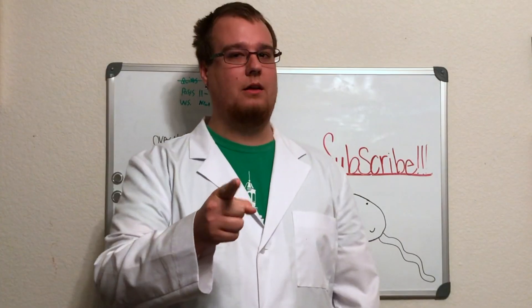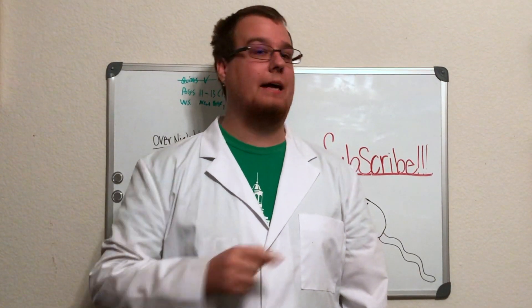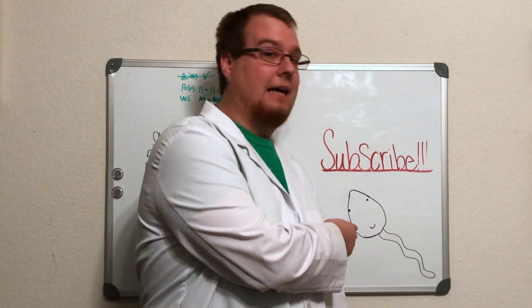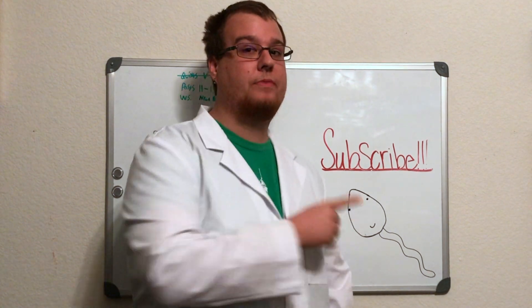Hey everybody, welcome to my fictitious laboratory where today we're going to be looking at something that I made just for y'all. We're going to be looking at male gametes, also known as sperm cells, as seen right here.